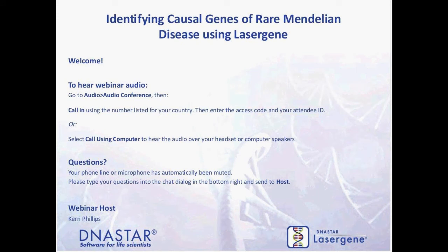I'm here with Jackie Carville. Jackie's going to go over how to use DNASTAR's Lasergene Genomics Suite software to analyze exome sequencing data. She'll be using a case study to illustrate how you might look for a causal gene of a rare Mendelian disease.